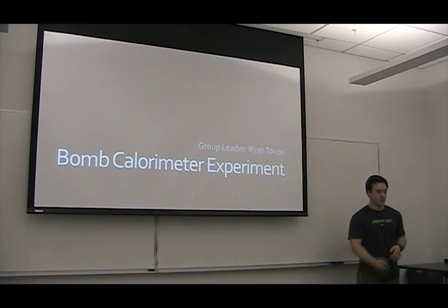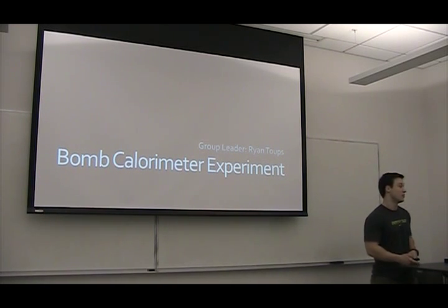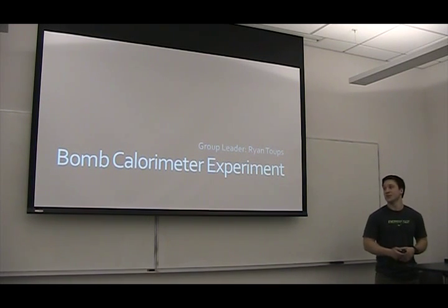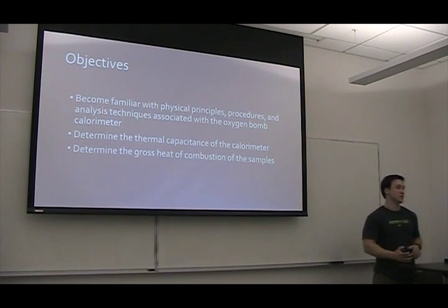Alright, so I'm going to be going over the same thing that Kyle went over a couple minutes ago, so hopefully by the end of this y'all will really know the bomb calorimeter. How do you say that one again? Calorimeter experiment. So first, our objectives for this experiment.